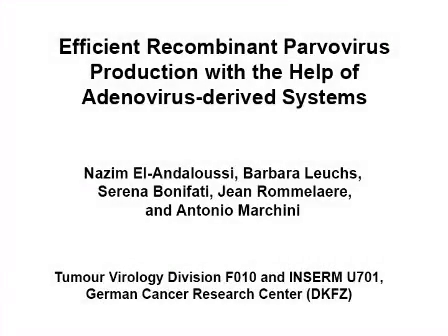The overall goal of this procedure is to produce recombinant parvoviruses, or RECPVs, at high titers while preserving their quality and reducing production times and costs.